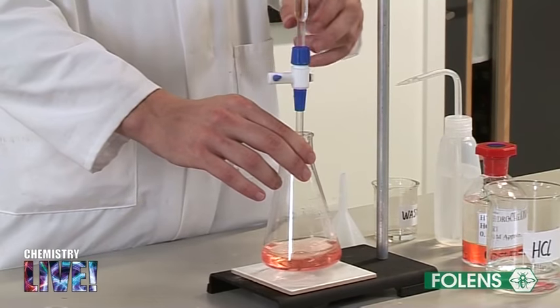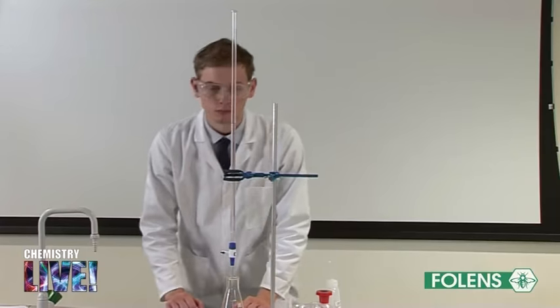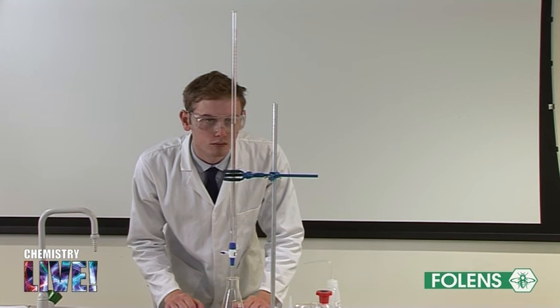When the colour of the indicator has turned pink, stop the titration and note the volume of acid added. A piece of white paper behind the burette will help you to take the reading more accurately. This rough titration tells you approximately where the end point is.